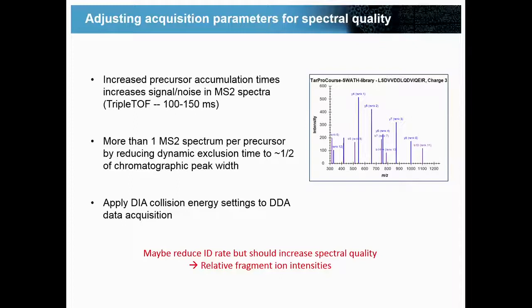So these three things are not something that we've tested very systematically, but essentially what I want to point out is that these things might reduce the number of total identifications that you get from the DDA.